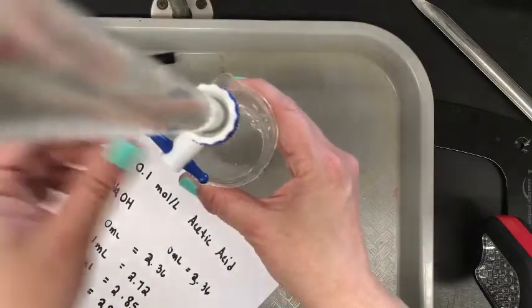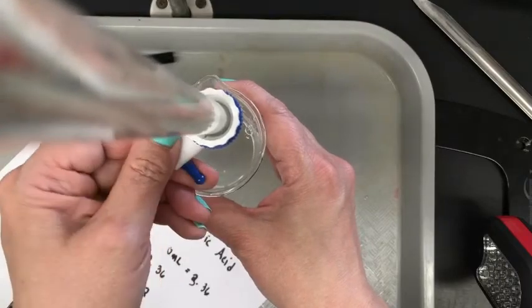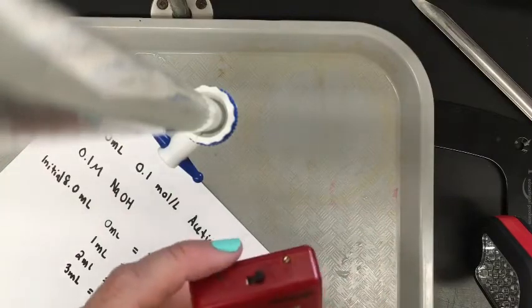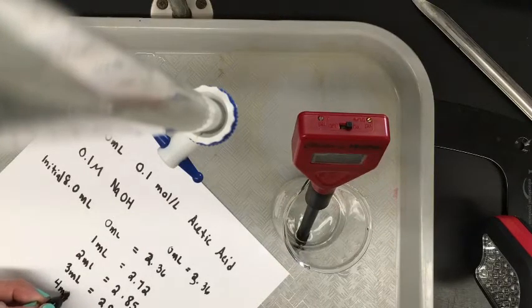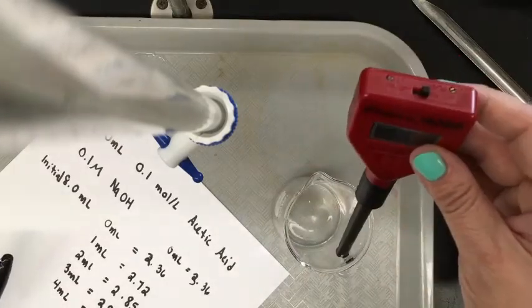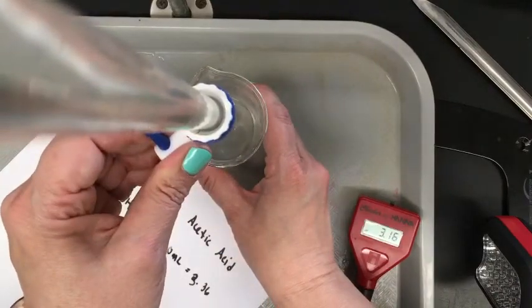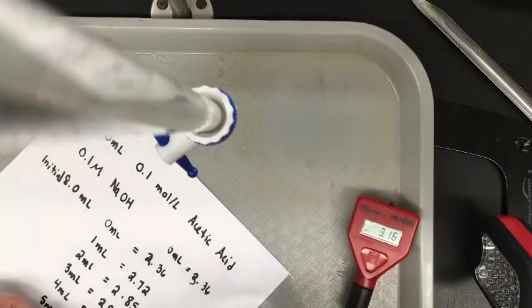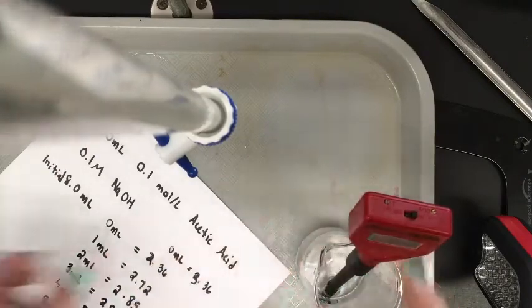Now I'll add another milliliter. There. Do a swirl, take a reading. We're up to 3 point, just let it stabilize. So at 4 milliliters, it's fluctuating, 3.10. Now we'll add a fifth one. So at 5 milliliters, we are at 3.19.